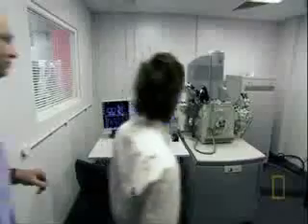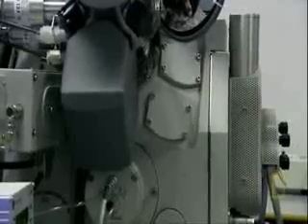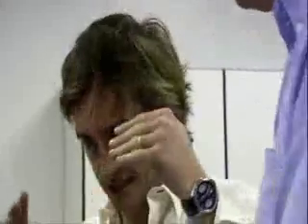So this is it, isn't it? Whoa, that's your atomic blaster. What do you actually call this thing for real? This is a dual beam environmental scanning electron microscope. Wow. Dual beam, I'm loving that. But microscope, that's just for looking at things. I want to sandblast things at an atomic level. Well, we can do that.